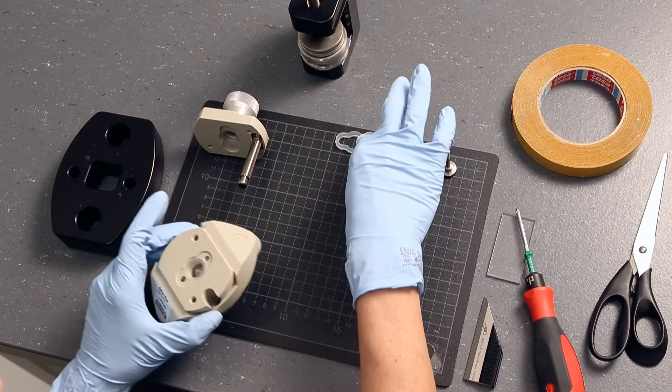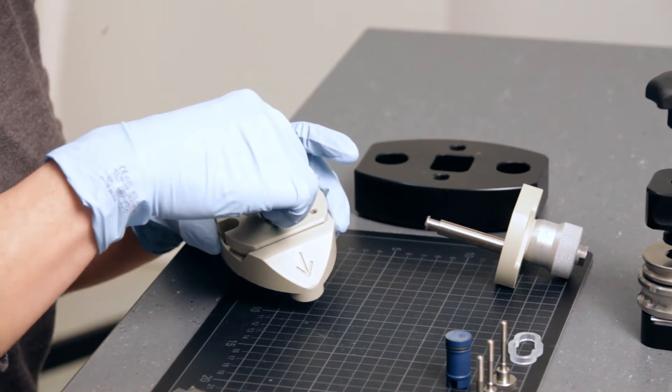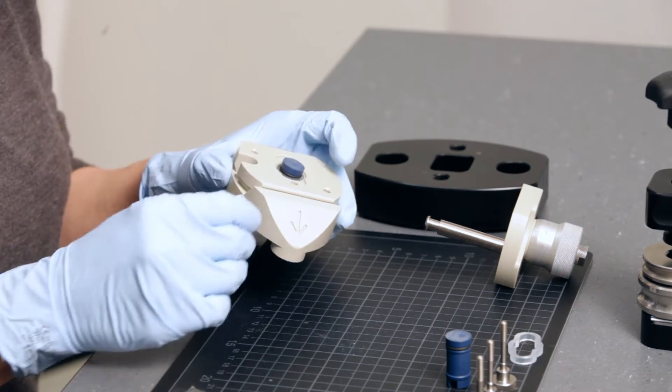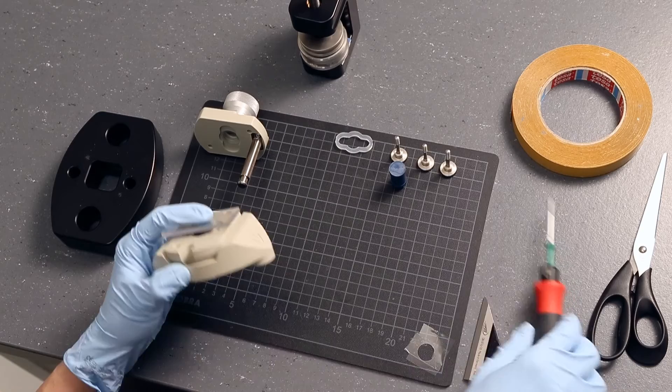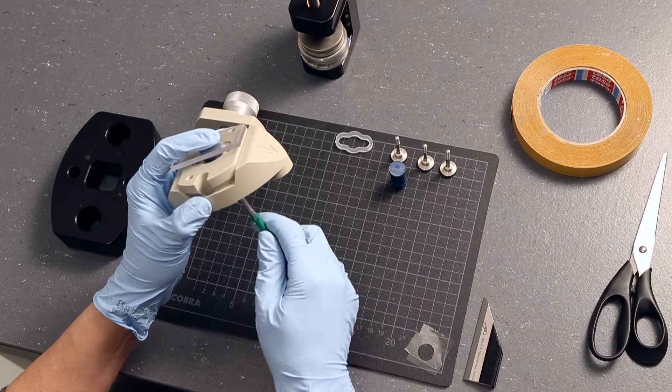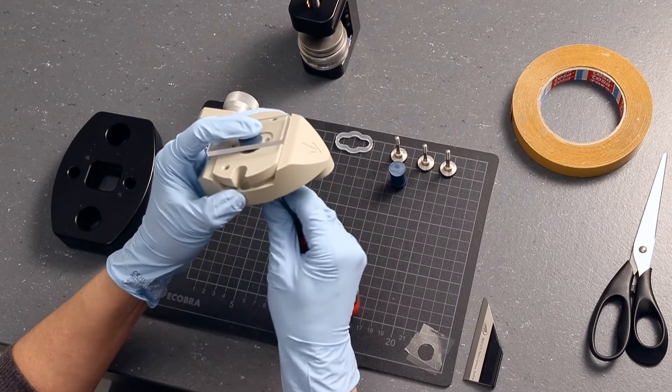Insert the small sample holder in the lower part of the cell. Use the support plate to push the sample holder into the recess while you lower its position with a screwdriver.